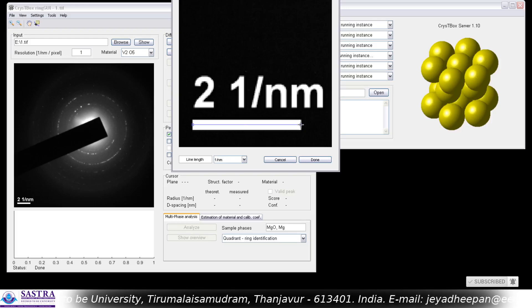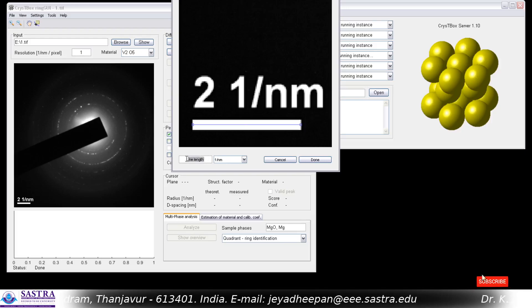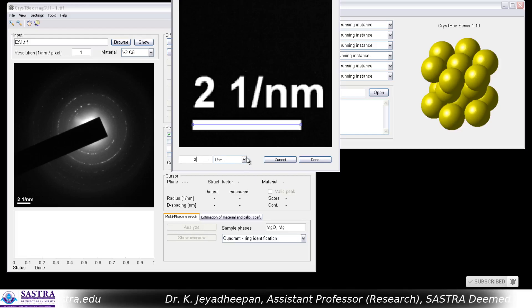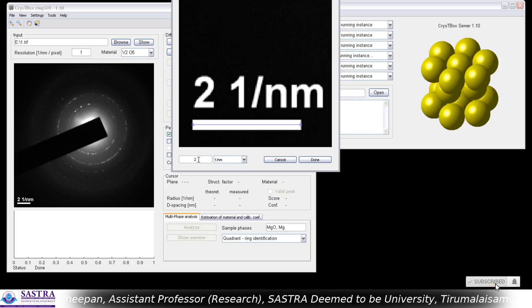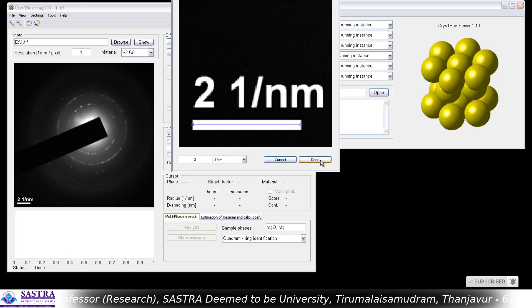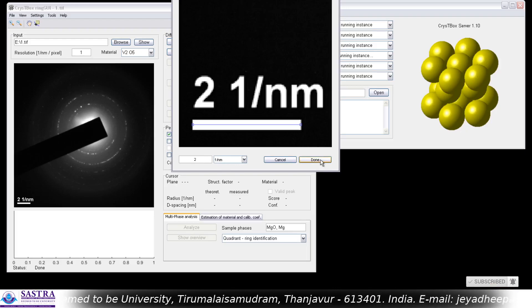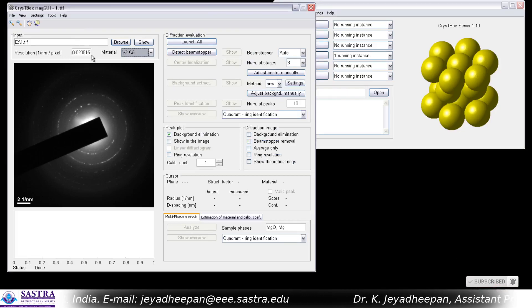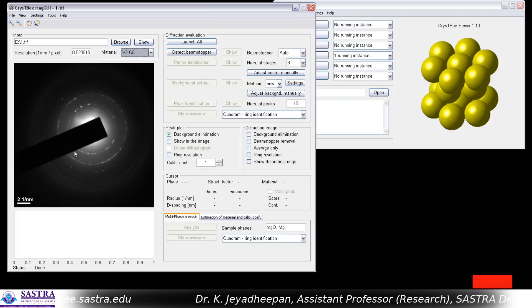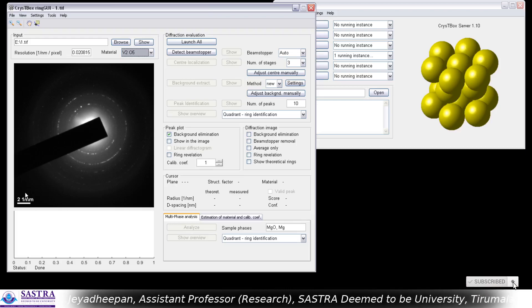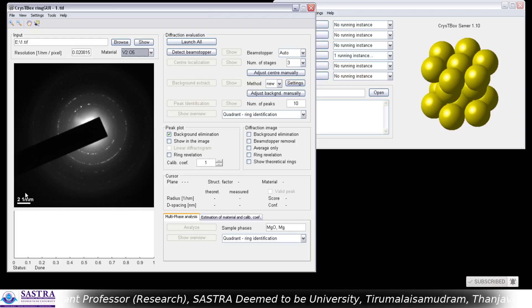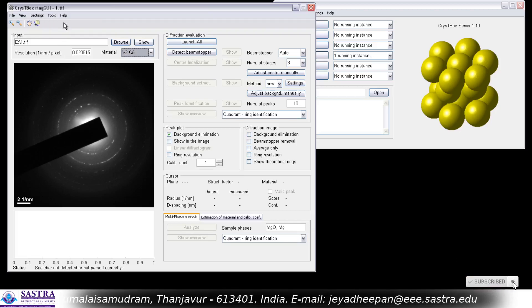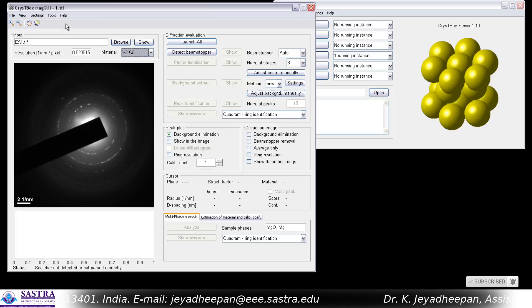This straight line length is 2 nanometers inverse in the reciprocal lattice, so I have given the value 2. Simply press Done and you will get the exact pixel resolution in the reciprocal lattice scale. Now we have calibrated the image. This image also has a scale bar, so we have to exclude it from our analysis. Go to Tools again and press 'Detect Scale Bar'. Now you are ready to go for the analysis.